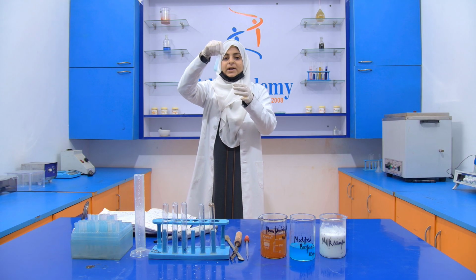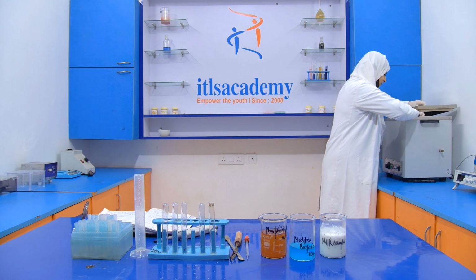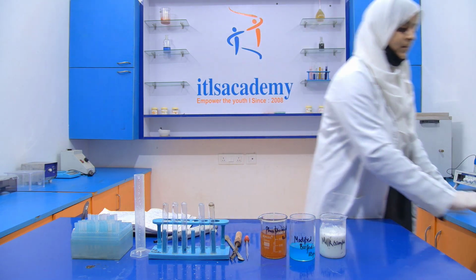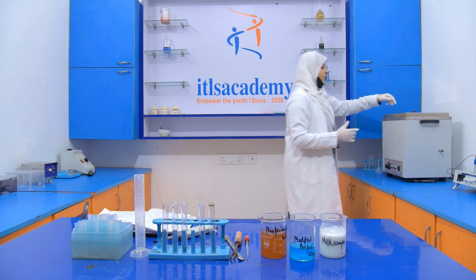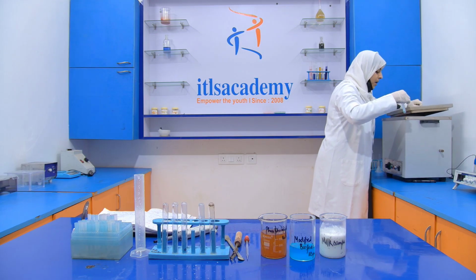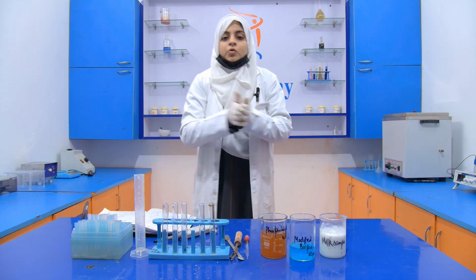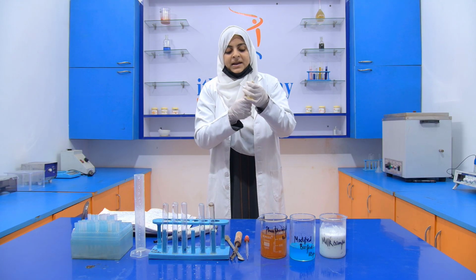a boiling water bath for 3 minutes. So I'm going to keep it. Now we will see the result after 3 minutes. After 3 minutes, I am going to take out the test tube from the water bath. Now we have to cool it rapidly. You can also cool that test tube in running water, but here I am cooling it by my hand.